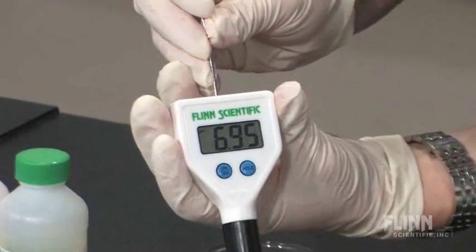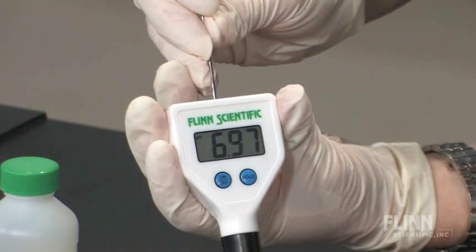Use a small screwdriver to adjust the calibration screw on the top of the pH meter until the display reads 7.